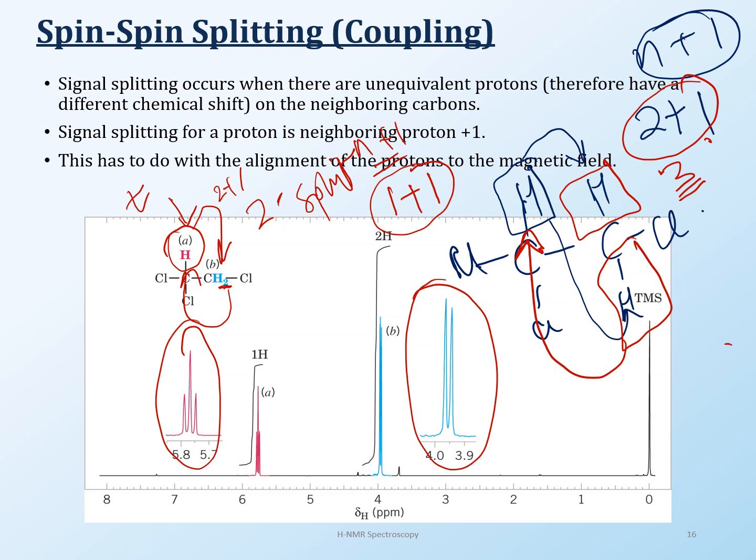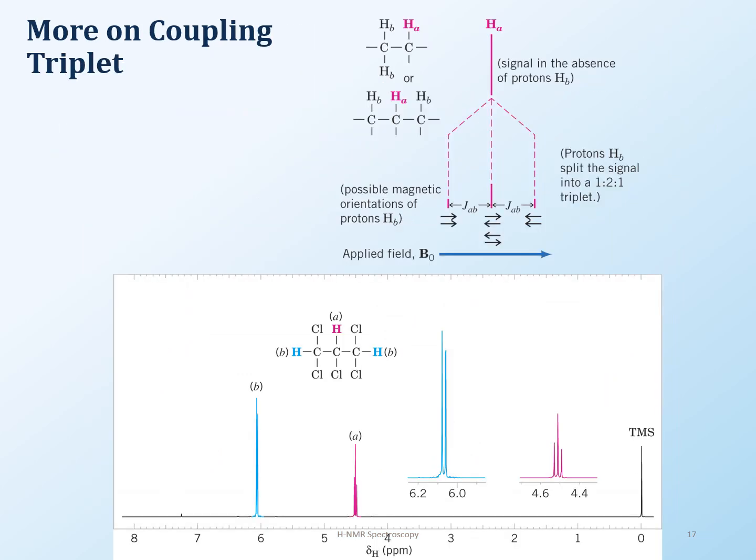Okay, and again, what are these orientations? So if you had just this 1 proton, it would give you that one orientation. So here is another example of that. So here is the triplet, and in the case of a triplet here, you can see very clearly right here how the orientations are working. I kind of drew this for you in the previous one. It was getting a little bit messy, so this one hopefully is a little bit clearer for you.